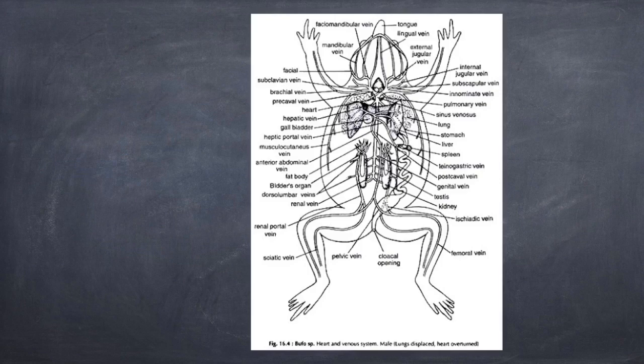Next will be the ovaries. They are dark organs filled with eggs. When not filled with eggs, they are small, flattened, pale, and irregularly shaped organs, attached to the ventral surface of the kidneys and only in female toads. Next will be the oviduct. It is a paired, white coiled tube, lateral to the kidneys, only in female toads.